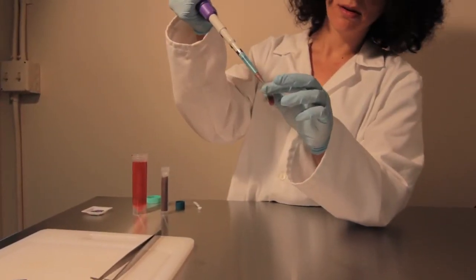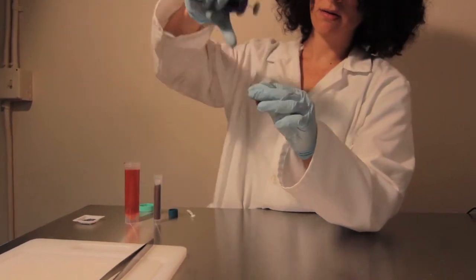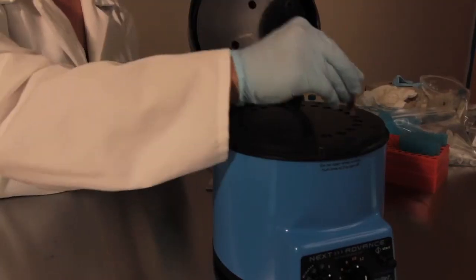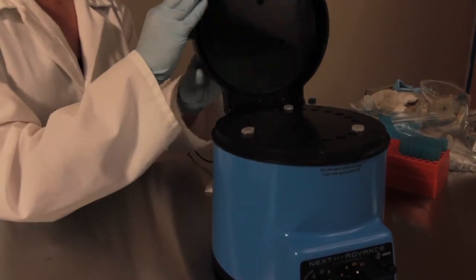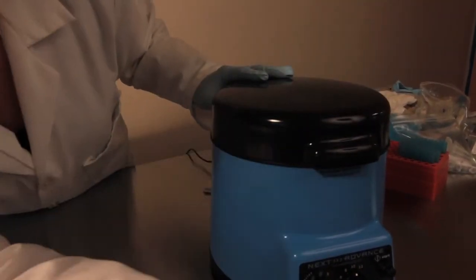We recommend using a volume of trizol no larger than 500 microliters for your homogenization in the Bullet Blender. If your sample size is larger than 50 milligrams, homogenize your sample in 500 microliters.